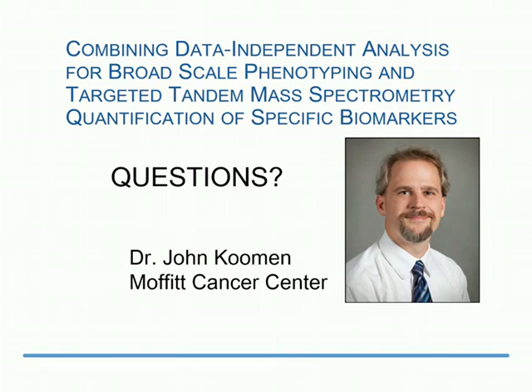All right. Next question is, how many targeted tandem mass spec acquisitions can be interleaved with the DIA approach? So I think at this point we would probably be comfortable going up to three. I mean, if we narrowed down our DIA window significantly or we had a higher frequency scanning instrument, then we probably would be comfortable to do more.